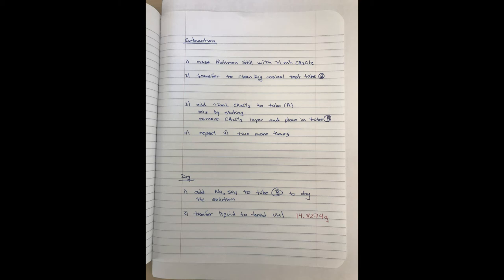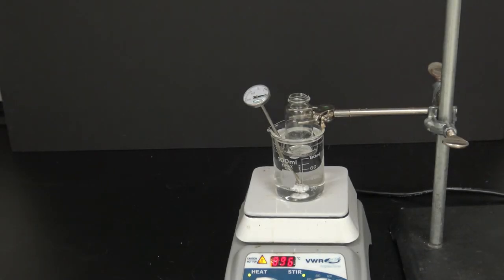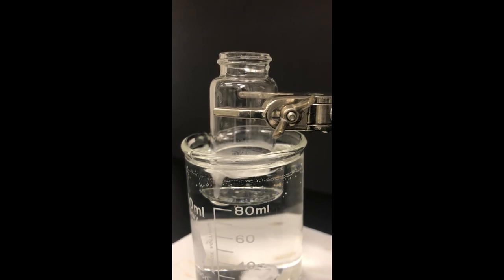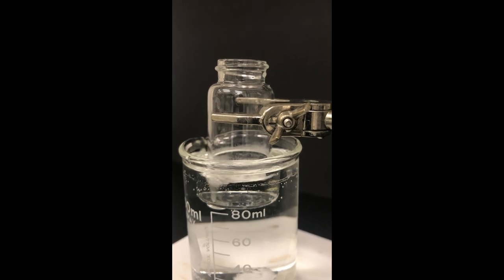Here is the notebook page for my extraction and my drying with sodium sulfate. I've set up a hot water bath on my hot plate. I've immersed my vial into that. The temperature is approximately 50 degrees C. That is hot enough to actually volatilize and evaporate the methylene chloride from my sample, but not hot enough to actually volatilize the essential oils.